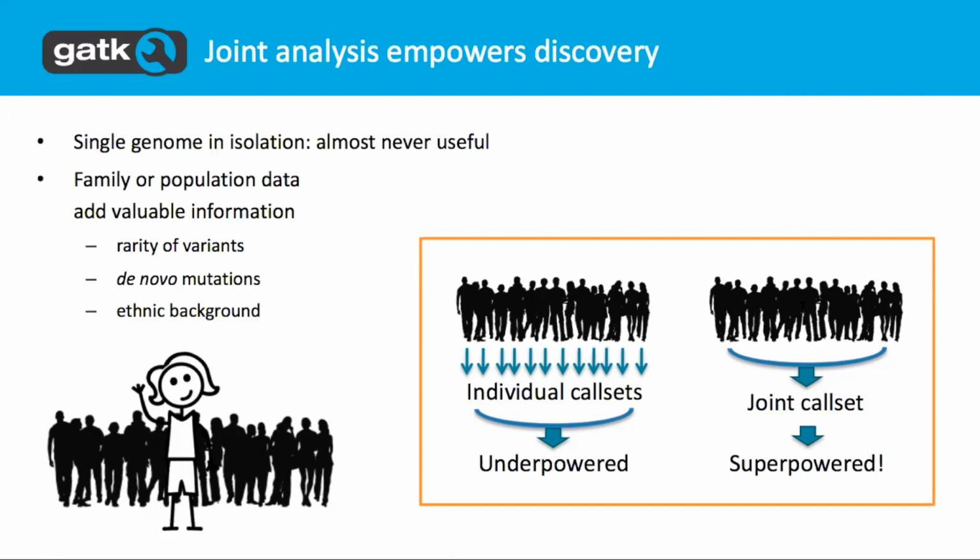And then you can also apply information from your family sequences to determine de novo mutations, and also give you better confidence over your calls, and the ethnic background to also improve your call set.